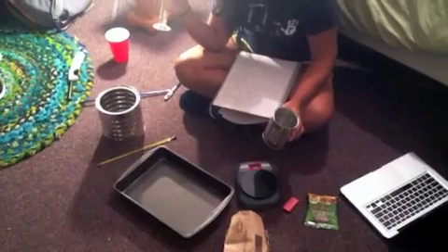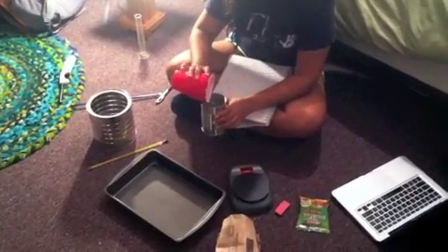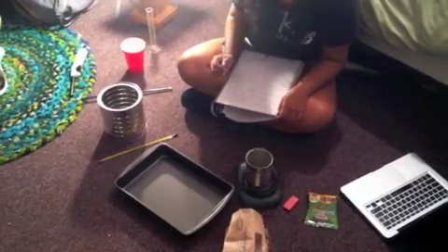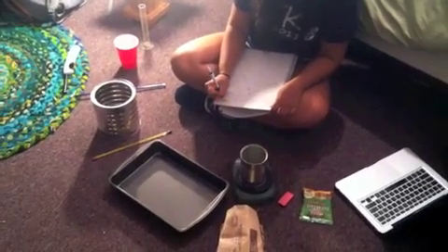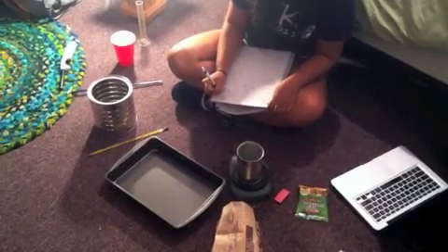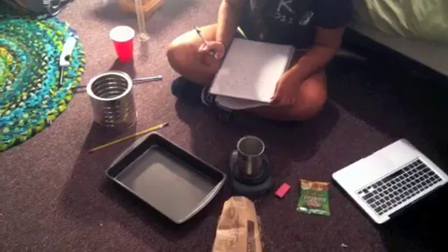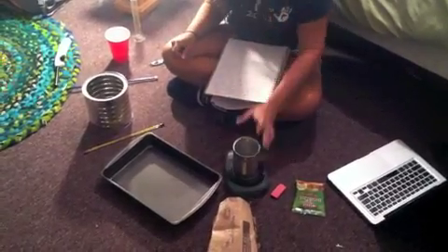With a graduated cylinder I measured out 200 milliliters of distilled water and I'm going to put it into the can and measure the combined mass. It reads 264 grams, and that gives us a mass of water of 197 grams, which I'm going to record.